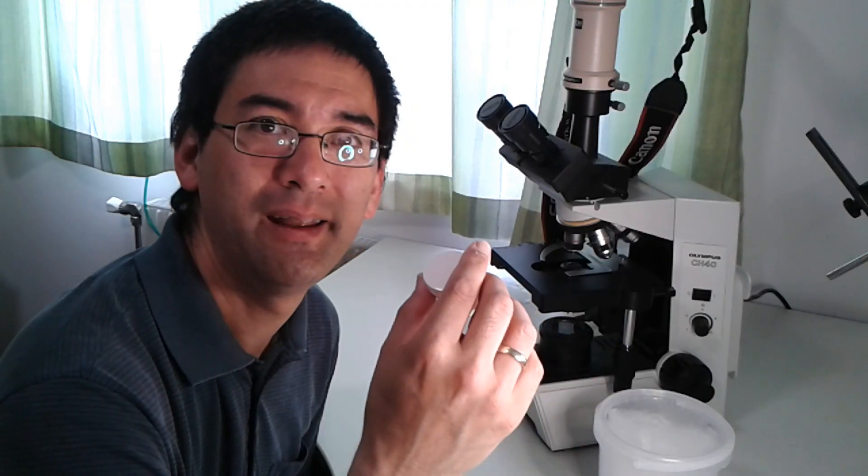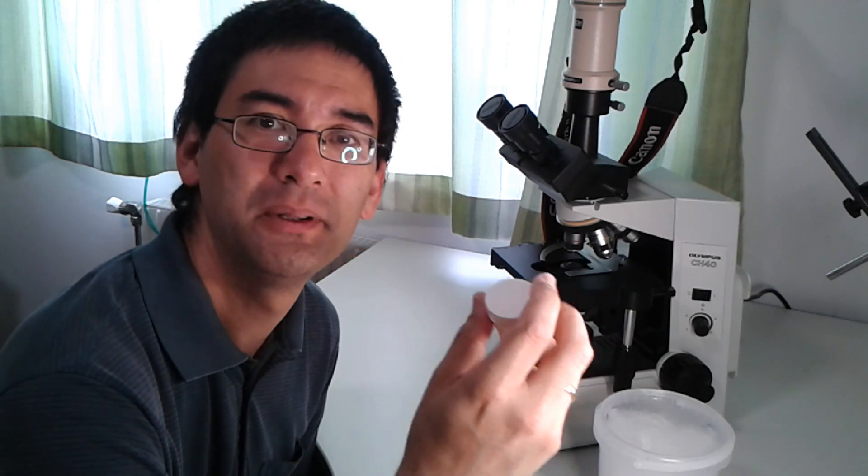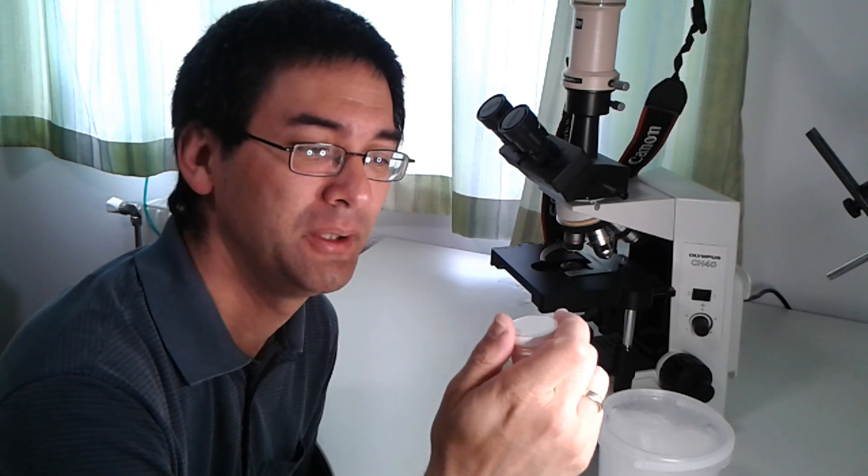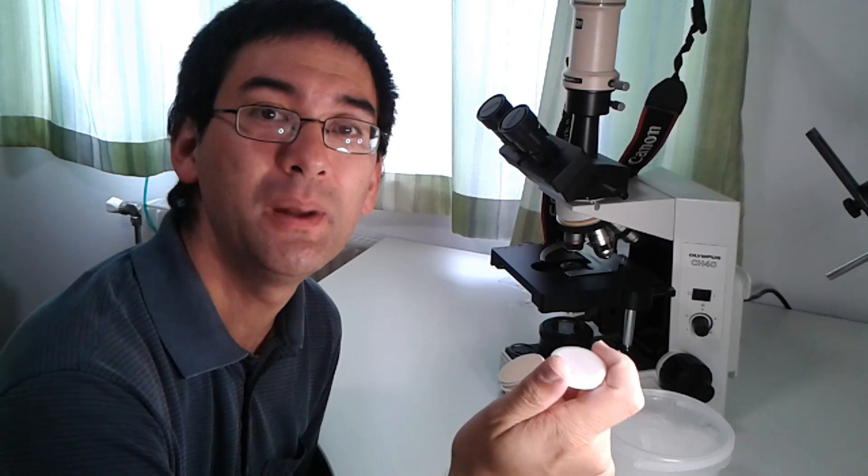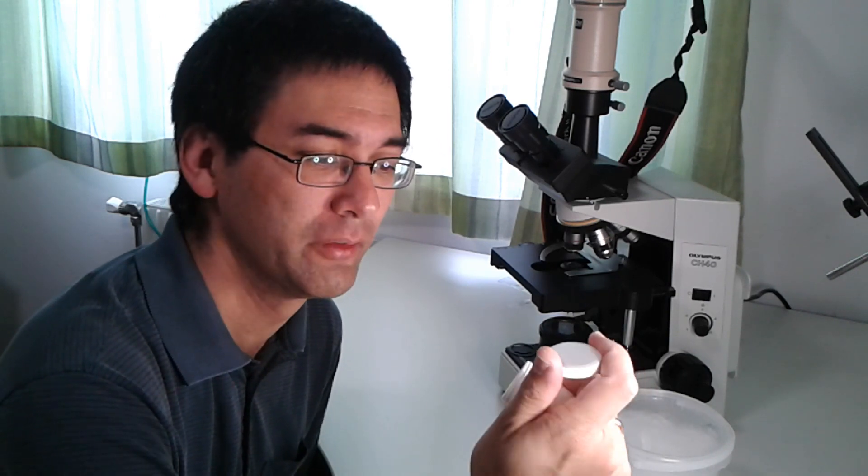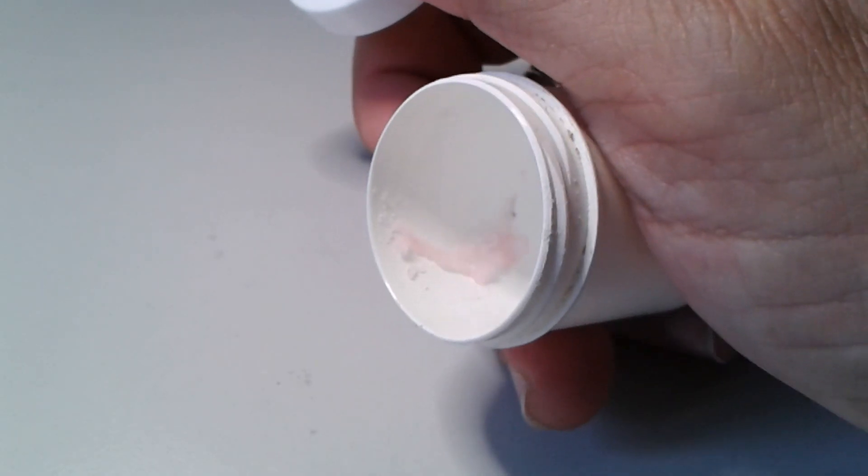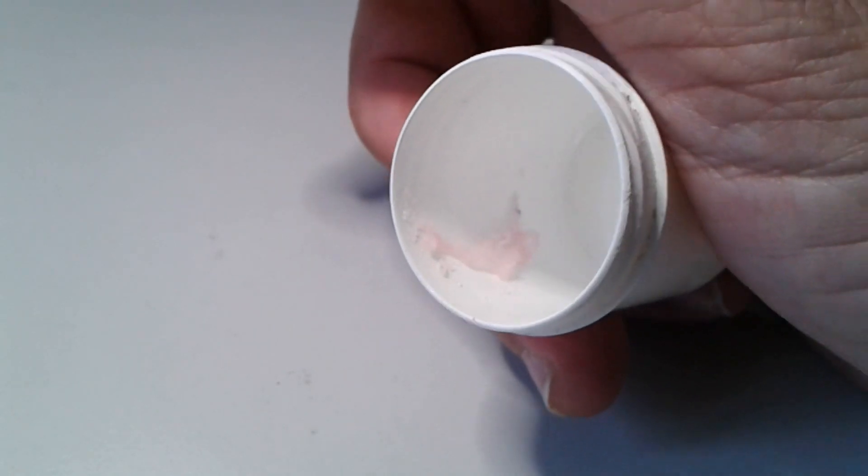I have to tell you that I was disappointed to find out that the cotton candy melted. It totally shriveled up and shrunk together, and it does not have any cotton-like appearance at all.